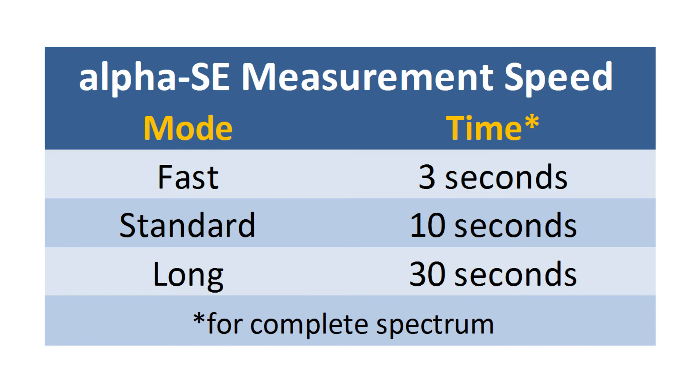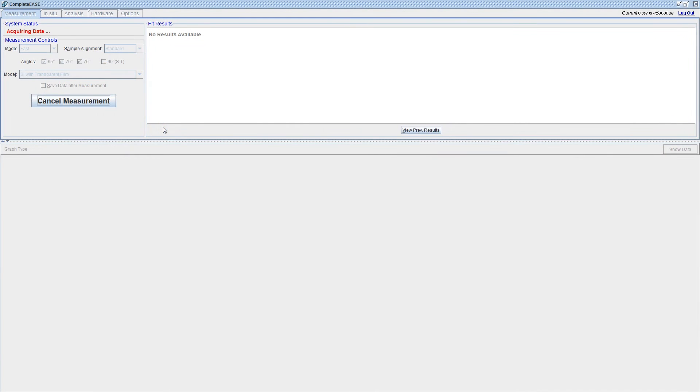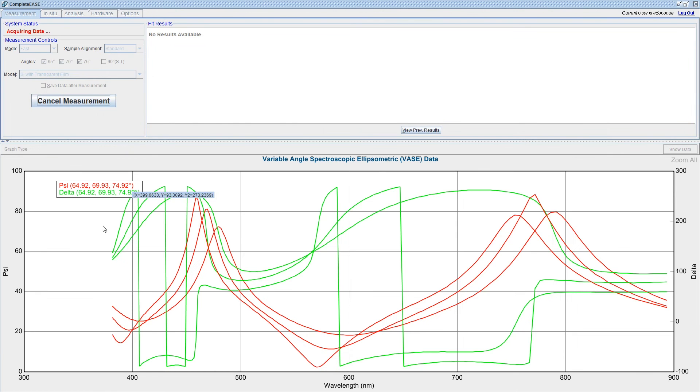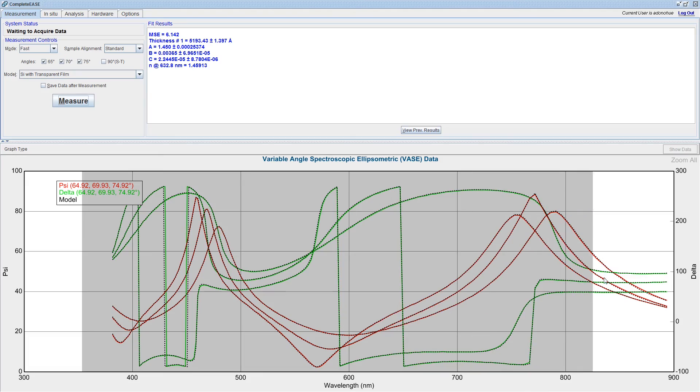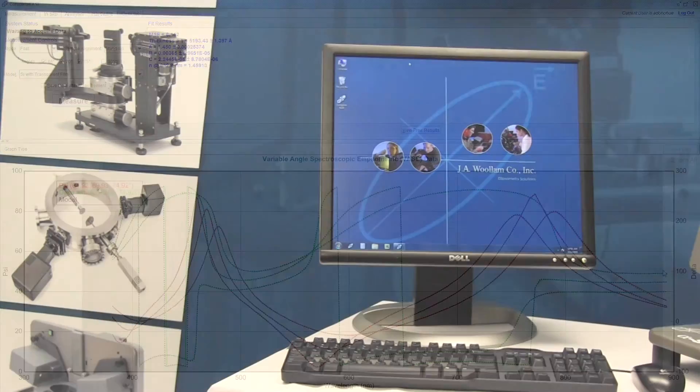The data acquisition speed is very fast. It will measure all wavelengths simultaneously in seconds. The Alpha SE measures 180 wavelengths from 380 to 900 nanometers.